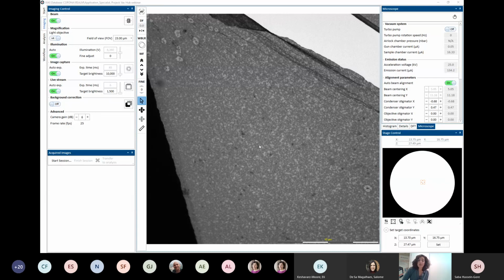So this is an AAV grid that we will be looking at. It has been stained with uranyl acetate, but there are also other non-radioactive stains that you can use. The uranyl acetate is the most commonly used stain. And you can see I didn't choose the very best looking grid in the world.